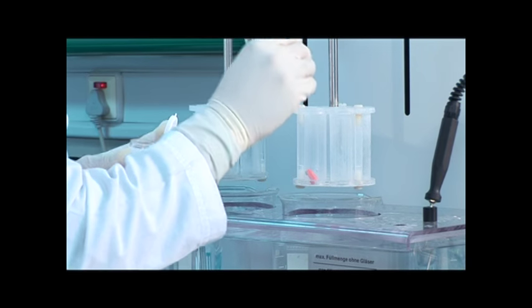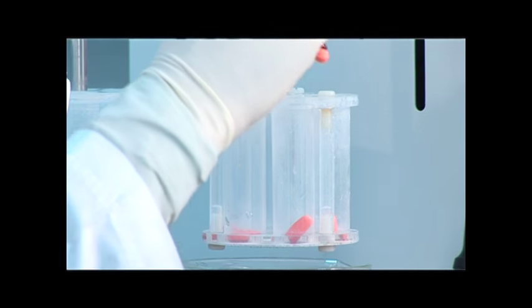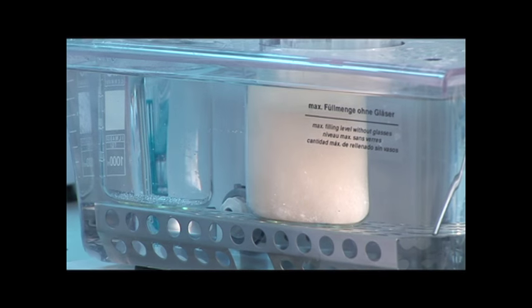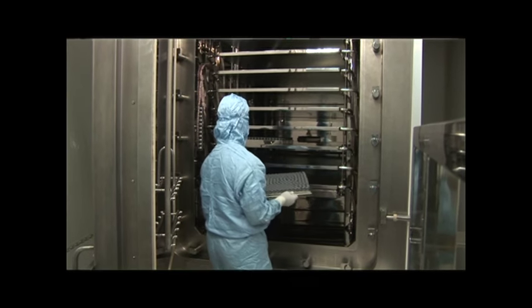Beacon is a centrally monitored fully automated plant with the help of integrated building management system IBMS of USA to ensure zero defects in our relentless passion for quality in everything we do.